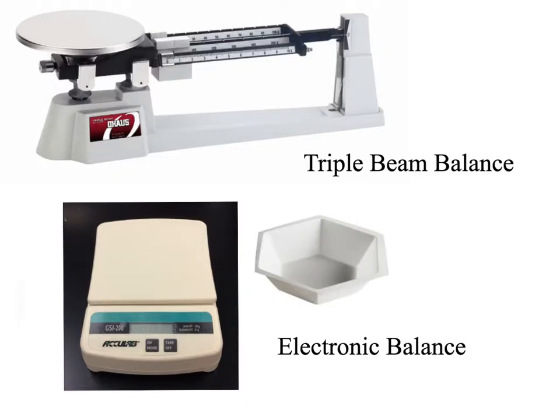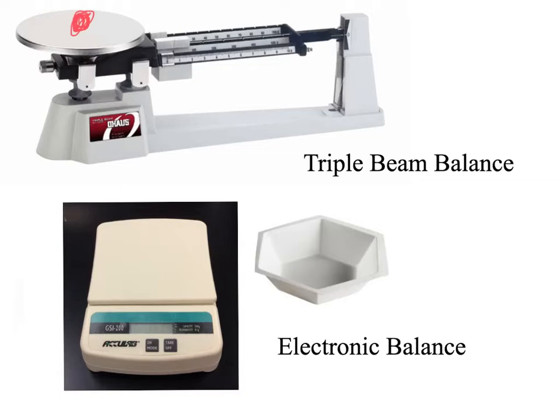There are two different devices we'll be using to determine the mass of things in the lab. The first is called a triple beam balance — you put the item you want to determine the mass of on the platform, then slide the weights over until the line matches up, and you can read the scales to determine the mass. The electronic balance has the same function — it also determines the mass of an item — but you simply put the item on it and press a button, and it tells you the mass in the readout display.